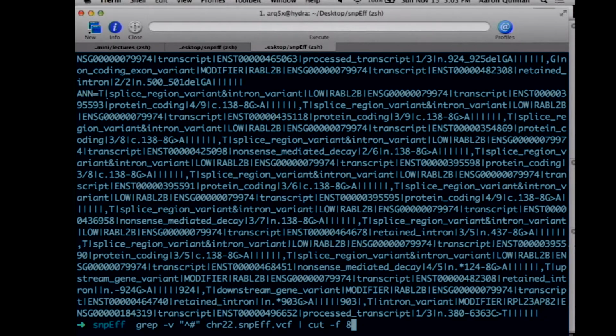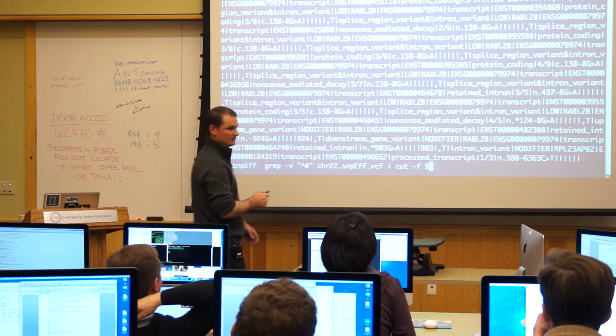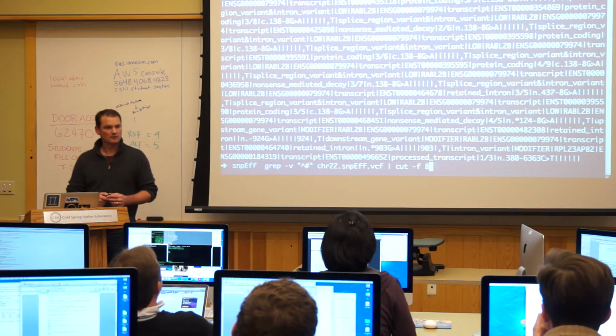So there's this big long string with all the pieces of information for that transcript. So then couldn't you just keep that and tell it that your separator is now commas?